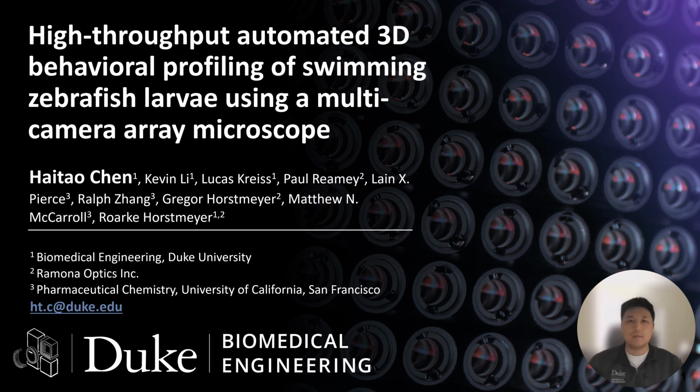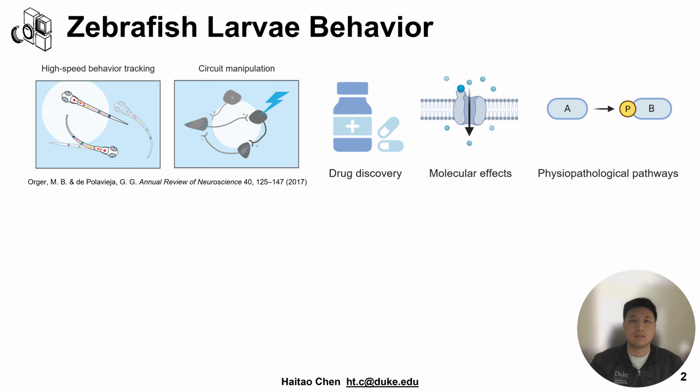Hi everyone, I'm Haitao. In this talk, I'll show how we achieve snapshot parallel 3D imaging across dozens of freely swimming zebrafish larvae, and how this platform enables automated, high-throughput behavior analysis.